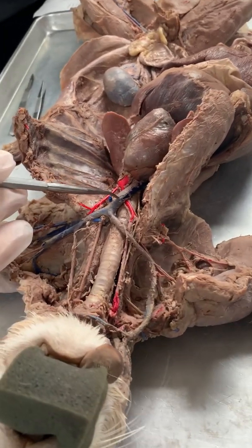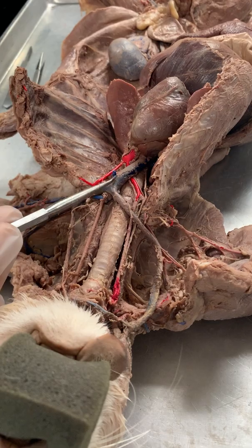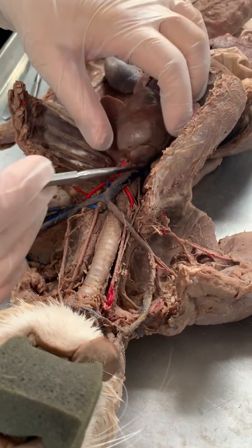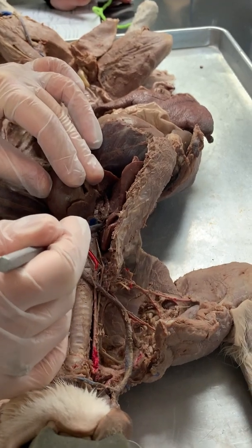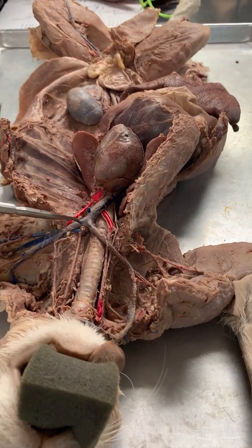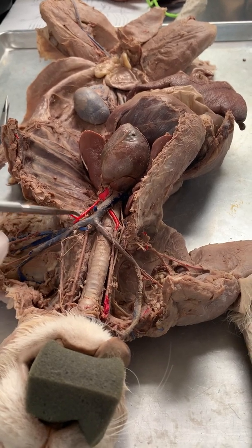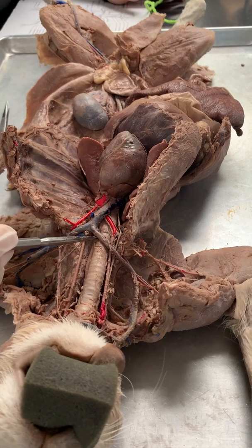This is the superior vena cava. Here's a nice example of the internal mammary vein. If you wanna look for your azygos, it's down here, okay? Here's the brachiocephalic, there it is. Brachiocephalic trunk. This goes into the external jugular.